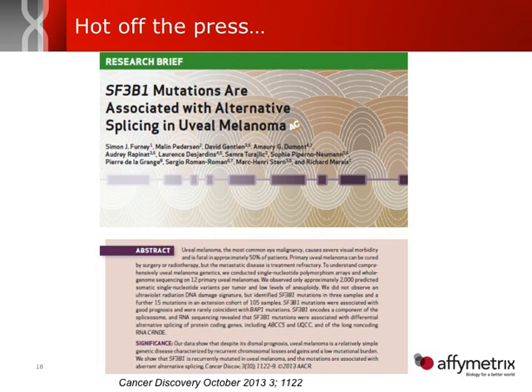And here is a paper that just got published actually this month, October 2013, in Cancer Discovery. It's a research brief. And what we're seeing here is this particular investigator looked at uveal melanoma, which is an eye malignancy. And they looked at RNA-Seq, Sanger sequencing, and also looked at HTA information, so data derived from our Human Transcriptome Array.